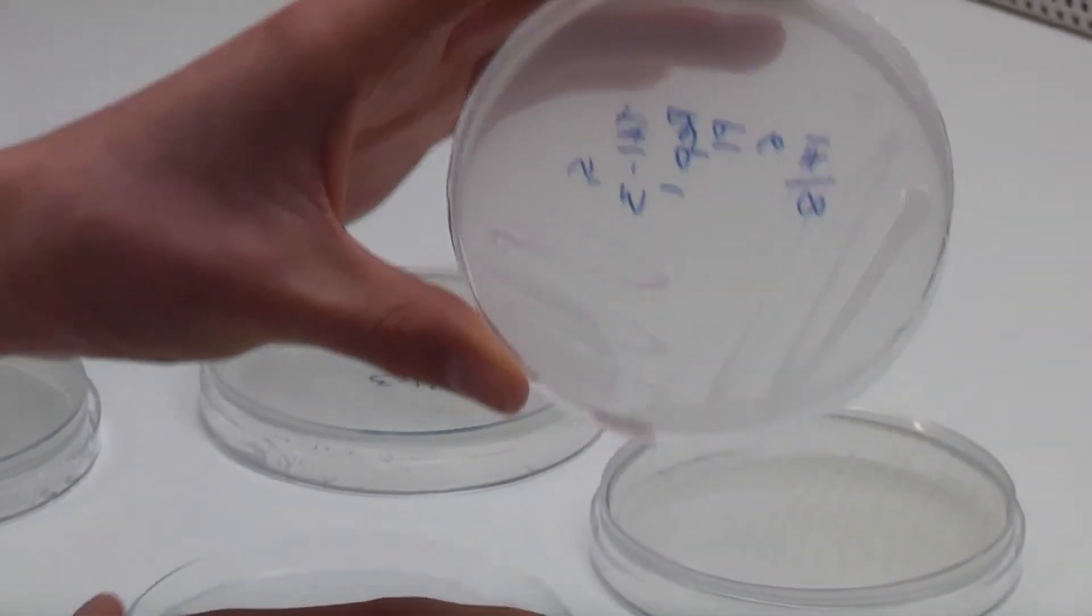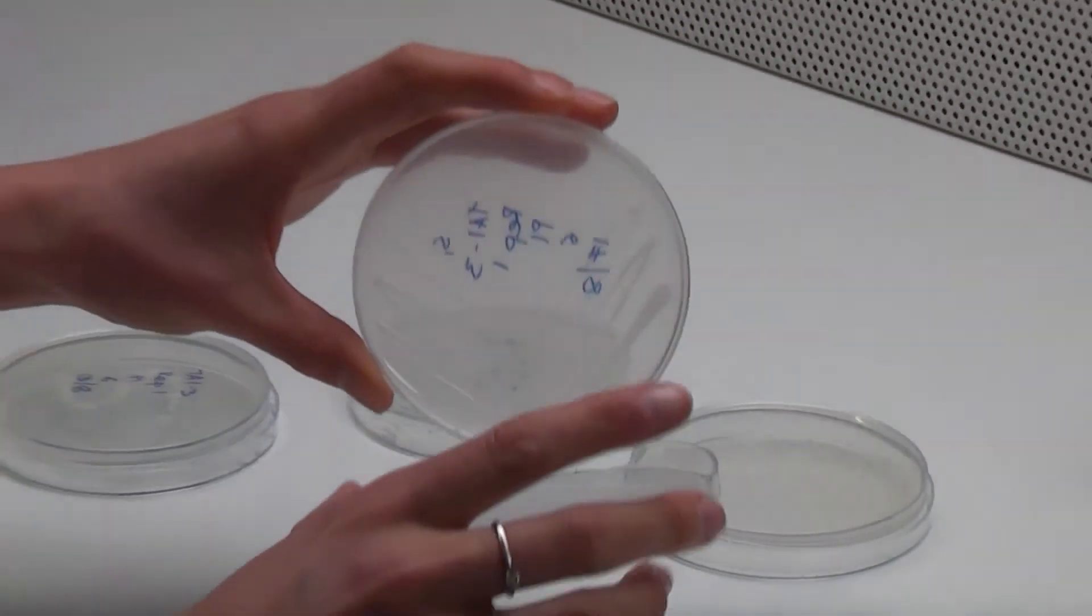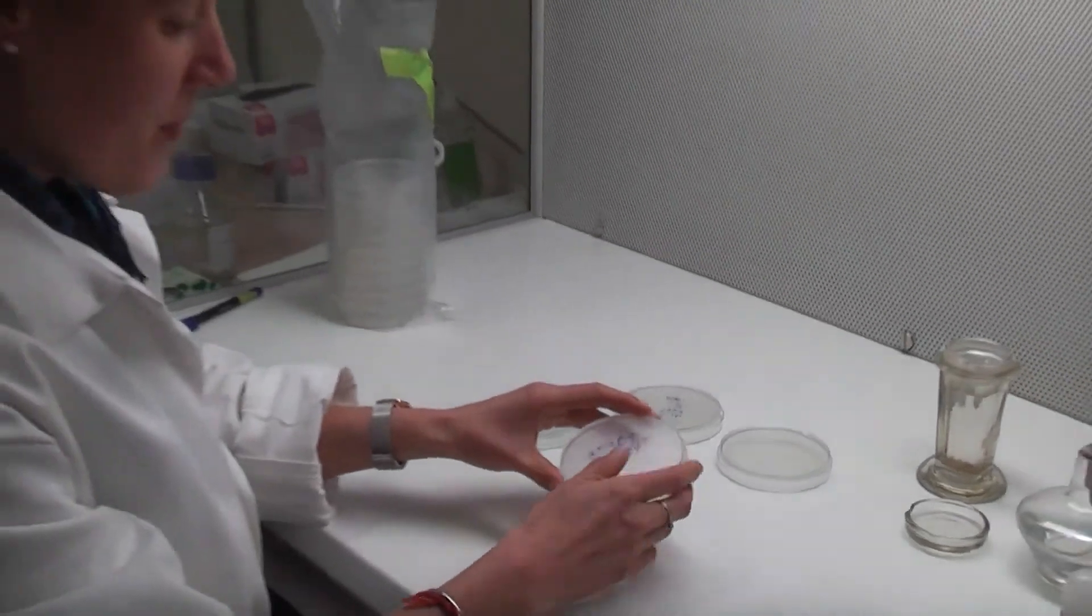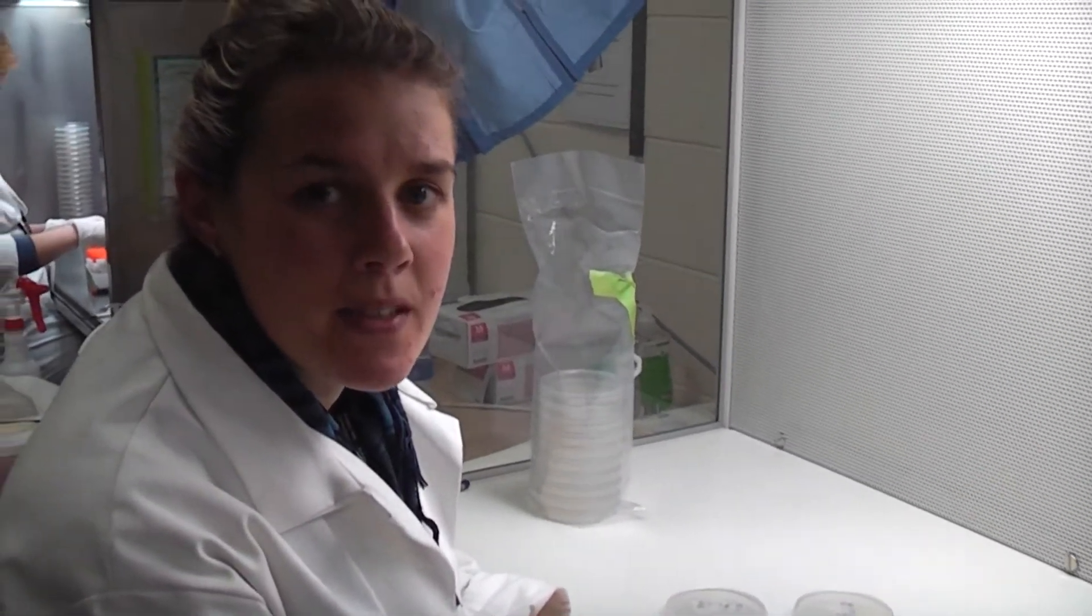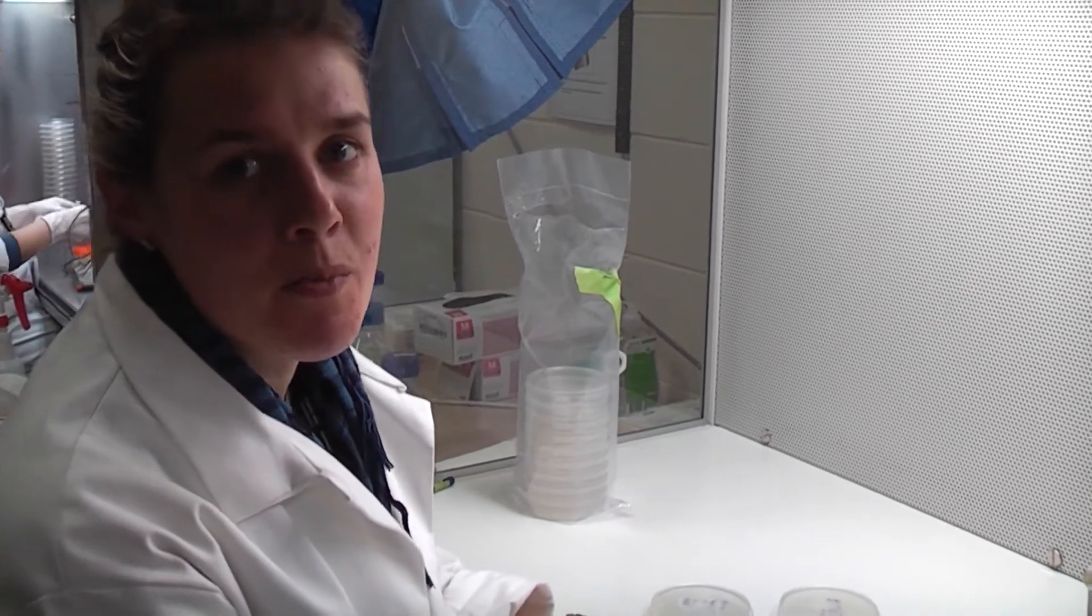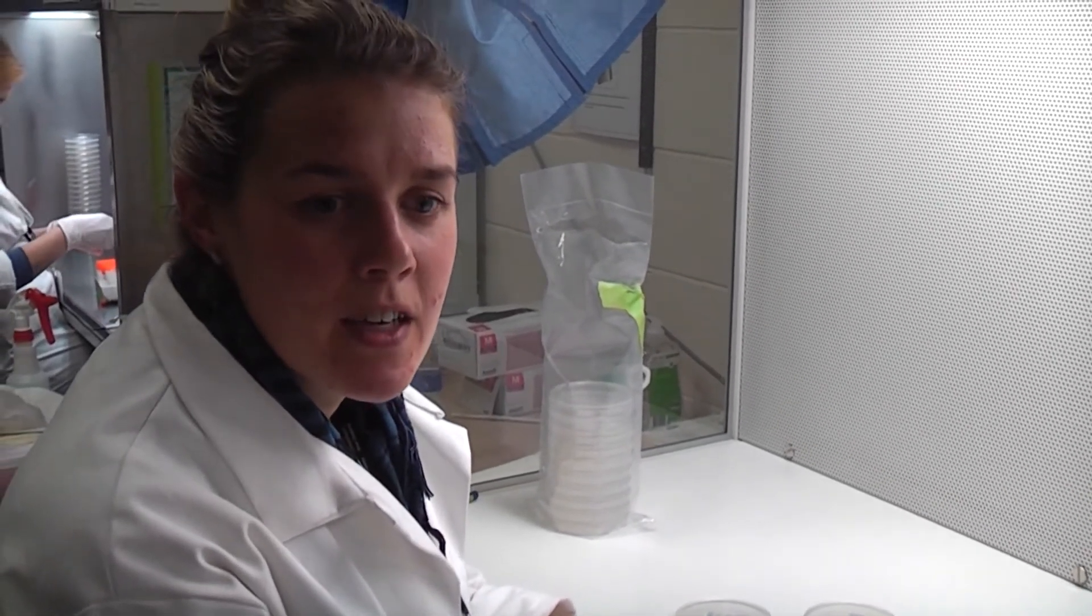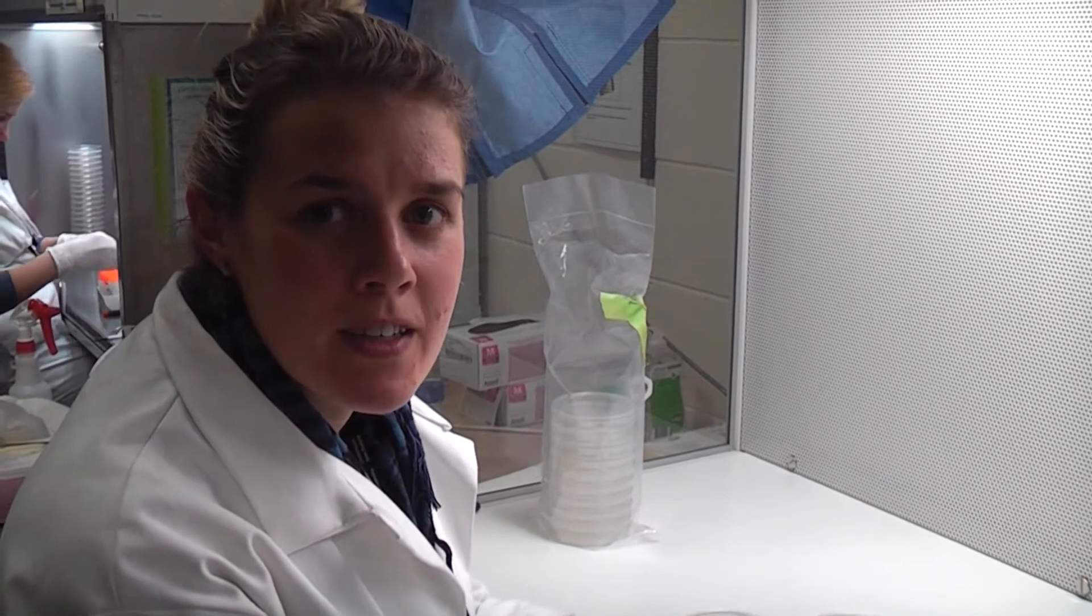And where have these rhizobia come from, Catherine? Right, so what these rhizobia are from, they've been isolated from white clover nodules from a trial at Lincoln University.